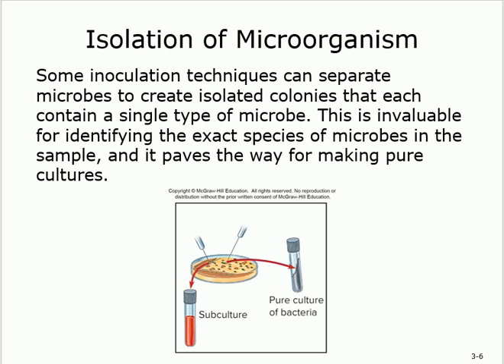So you're done with the incubation. You put it there, you set a controlled temperature, you put the medium, it's growing, you looked at it, and it looks like it is okay now. So what should you do next? You are going to isolate the organism. So let's say I got a sample from urine or something, and you put it in that medium, you look at the changes, you can tell that it is changing, so you're done now. And then you're going to isolate the different organisms.